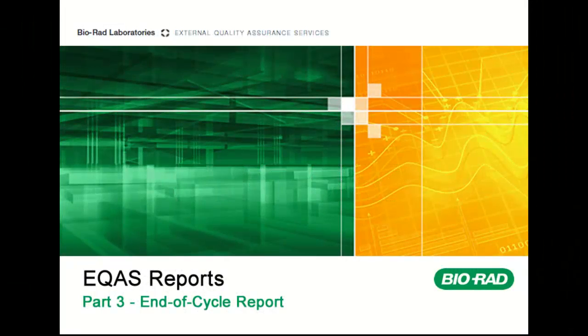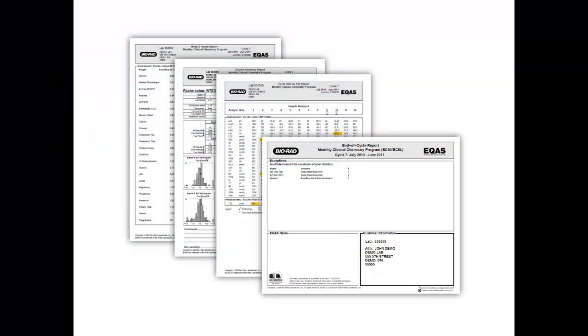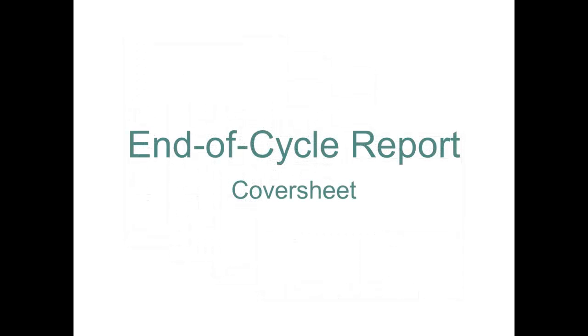At the end of each program cycle, you'll receive an end-of-cycle report. This report provides an overall final assessment of your laboratory performance for each reported analyte relative to the participating laboratories. The report consists of 4 parts: a cover sheet, cycle data on file report, analyte summary report, and a mean z-score report. Let's look at these in more detail.